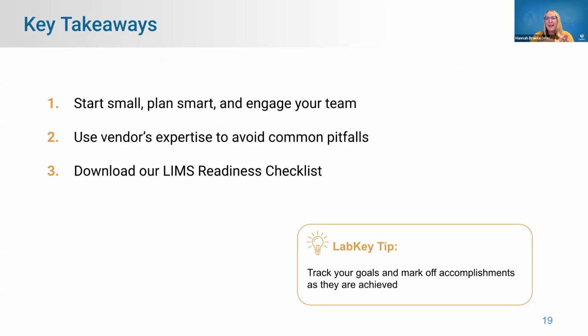Making sure that that planning is done prior to getting the work done, and engaging your team. Using the vendor's expertise to help support this. Again, we as vendors have done this for a lot of years for a lot of different types of clients. At this point, I feel like we've almost seen it all. I'm sure other LIMS vendors feel the same. And so ensuring that you're really getting the support you need from your vendor.